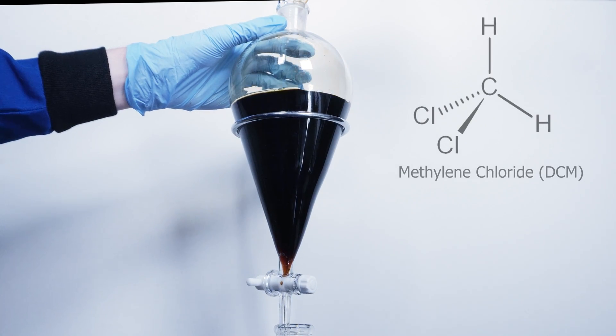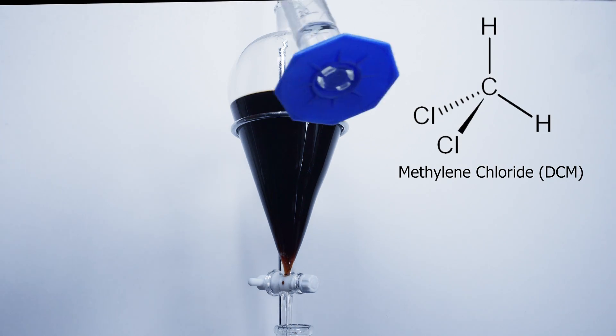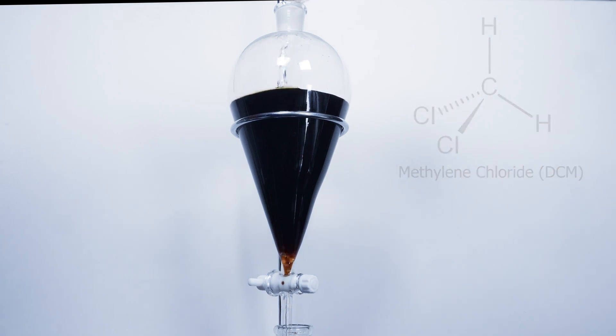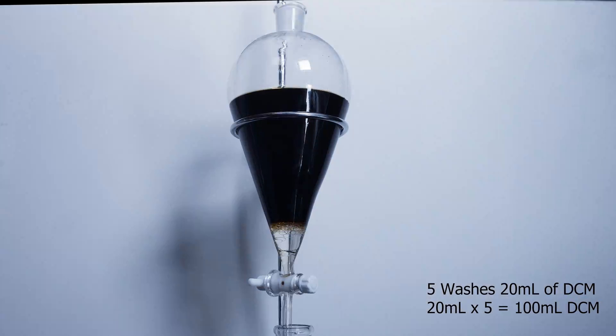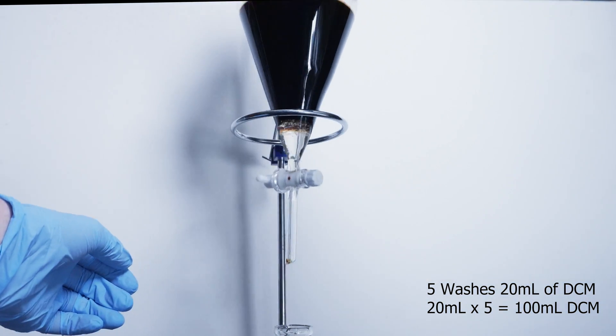Once chilled I added all my coffee into a 1 liter separatory funnel. In this stage I will be using DCM or methylene chloride to extract the caffeine from the coffee — this is also known as a liquid-to-liquid extraction. The caffeine will favor the DCM over water and get pulled into it. We can see that when I add the DCM it all sinks to the bottom, because DCM and water do not mix and DCM is heavier than water. I will do 5 separate washes adding 20 milliliters of DCM each time.